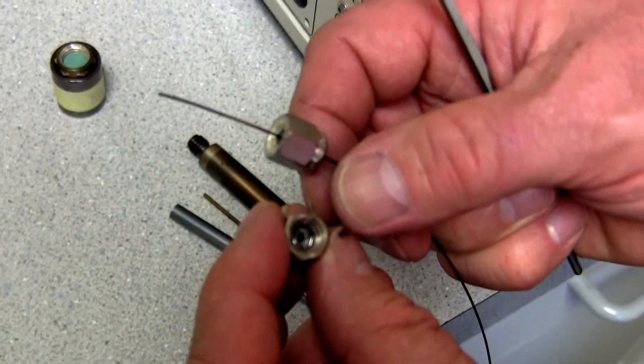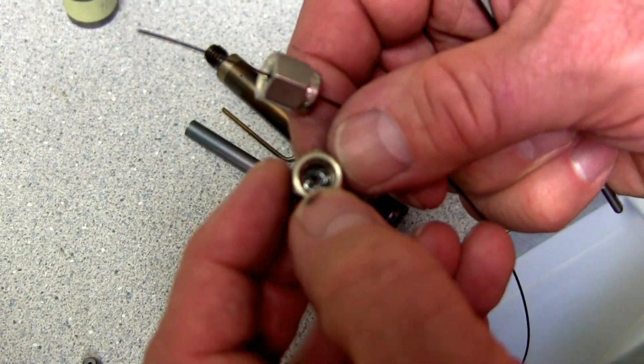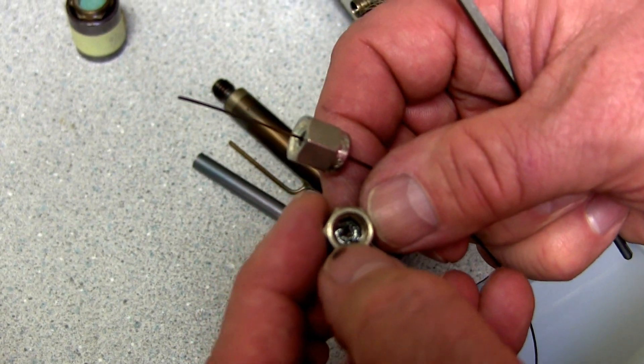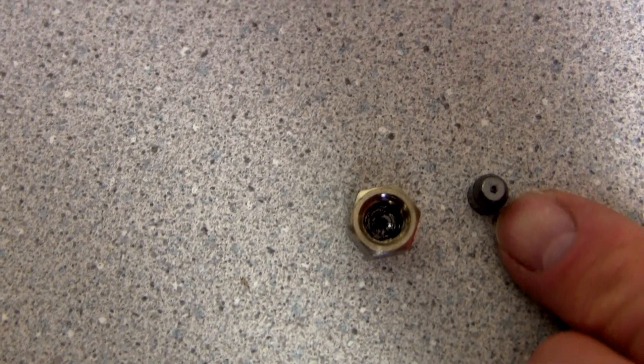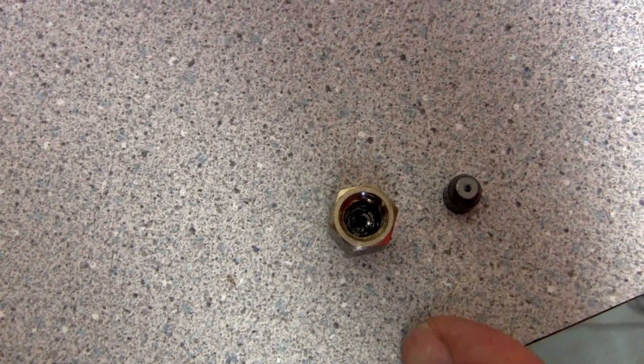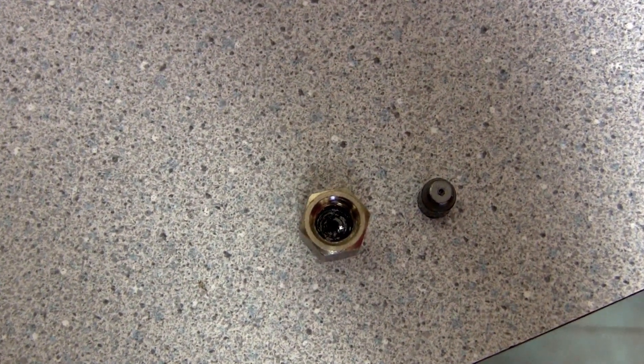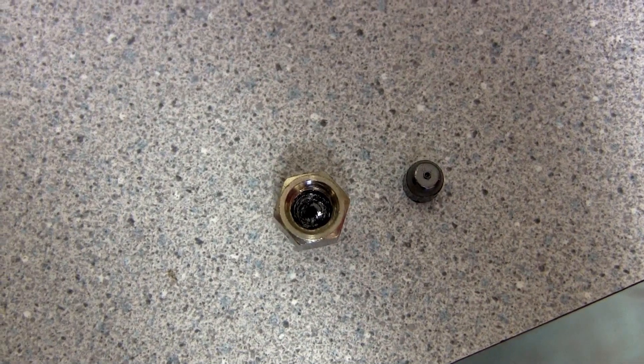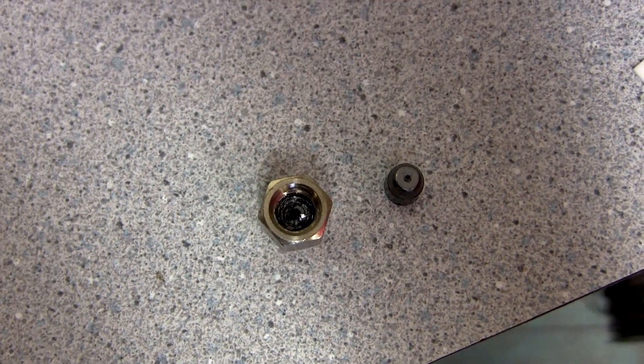When they get damaged, usually what happens is the ferrule falls apart inside the nut. Some of the graphite is still stuck in the nut, but the front part of the ferrule, the conical part, usually sticks in the fitting that you're removing the nut from. That's the one that you have to be careful not to lose down in the oven because it could cause some problems if it contacts the oven heater.